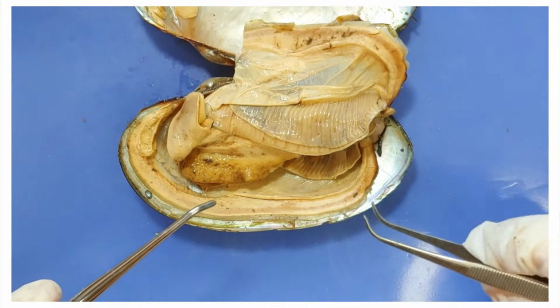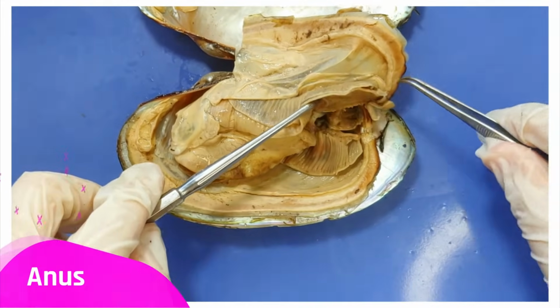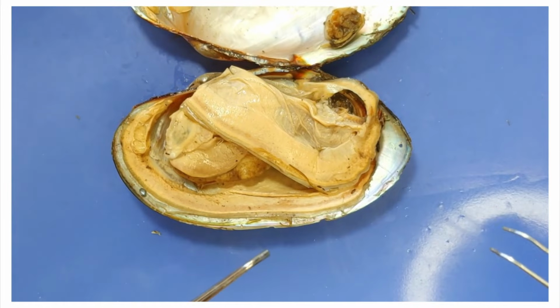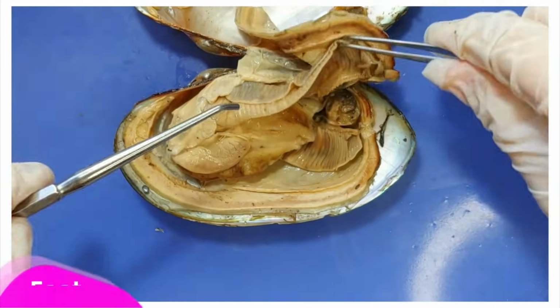Well, it seems like Lady Luck has forsaken us today, my friends. The anus is on the opposite end, where waste is expelled, but that's also really hard to see, so guess not. Now, if I remove all these, we'll be able to see the foot.